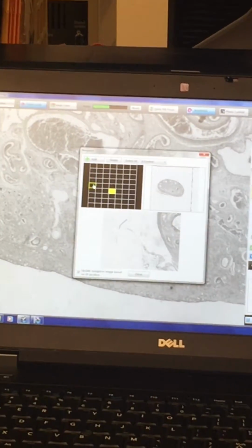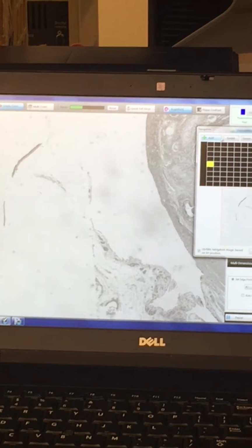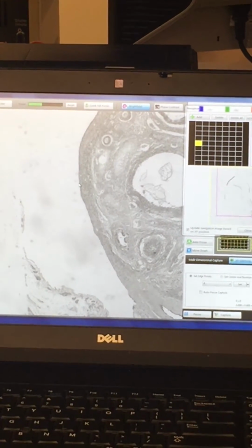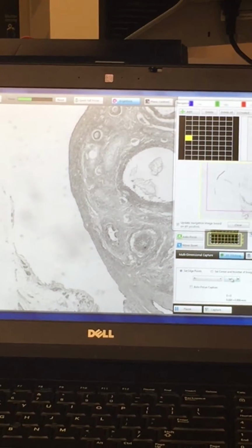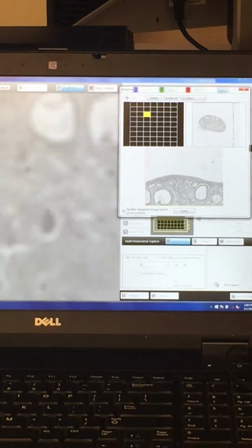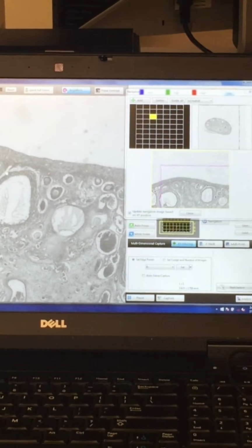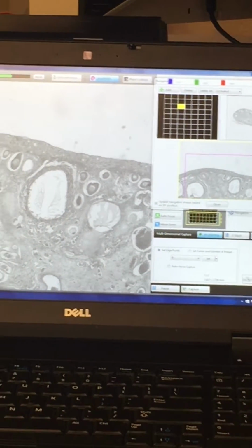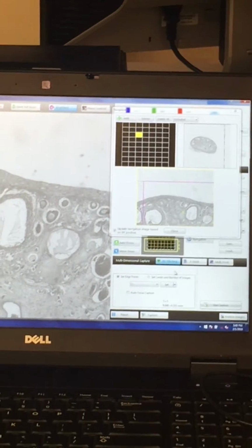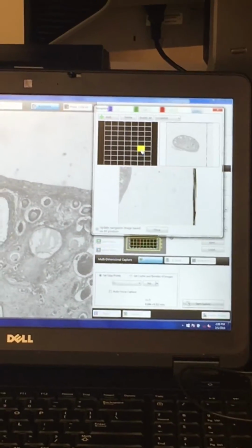So I'm going to go right here. At a lower magnification, it doesn't matter too much, but you're going to want to find focus, and then click set. I'm going to set my upper point, so right about here. Again, you're going to want to find focus and click set. You can either use your mouse wheel or just do move down and autofocus. It works all the same.